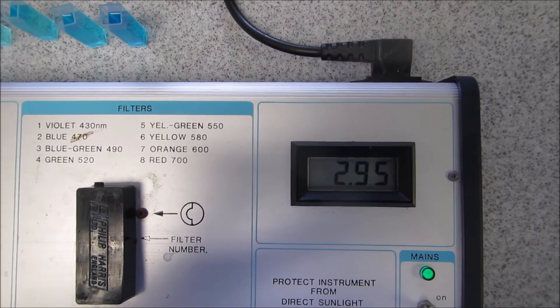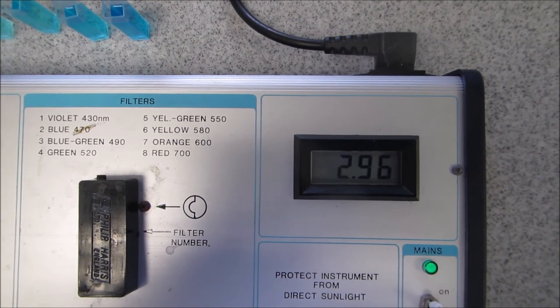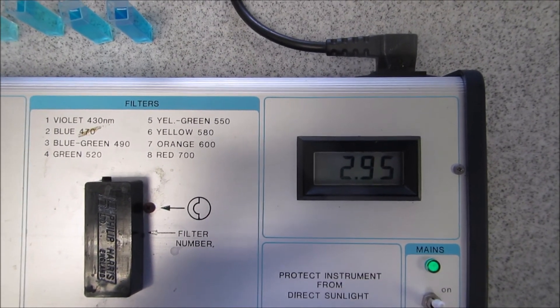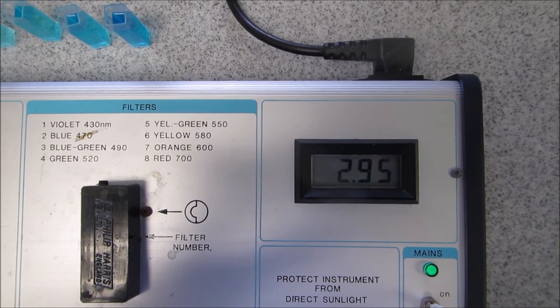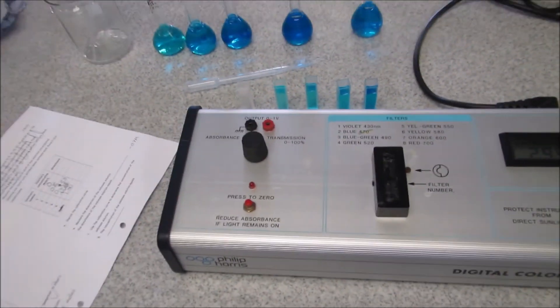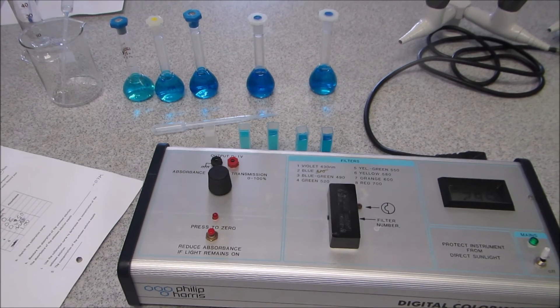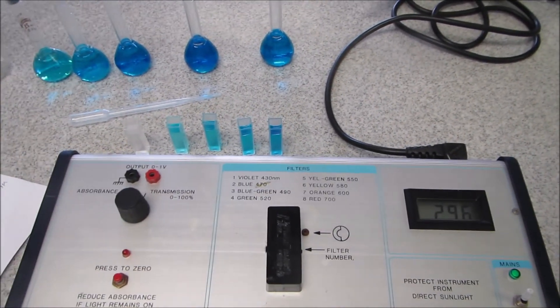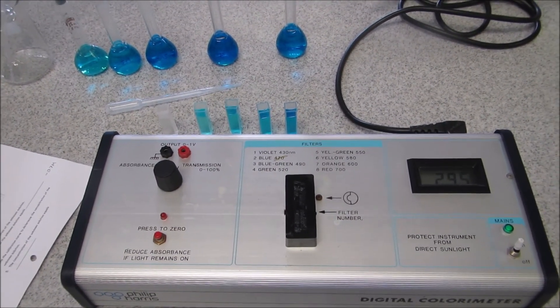Once it settles you can now use this absorbance and your calibration curve to read across from the absorbance to work out what concentration it actually is. That's how you can produce a calibration curve on a colorimeter to work out the concentration of an unknown solution.